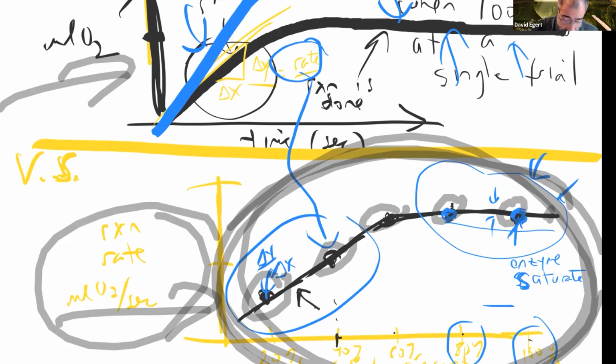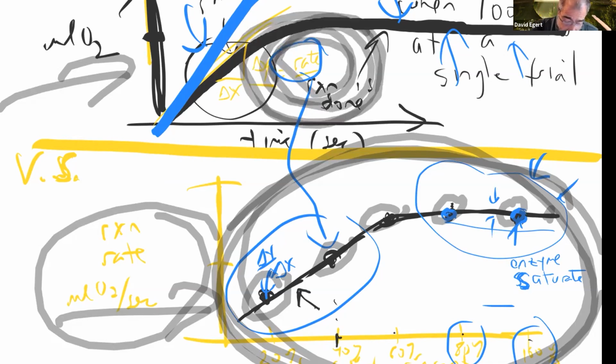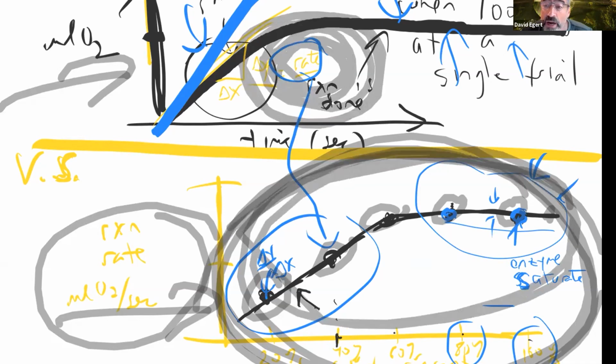How do we actually get the reaction rates that we can then use to check if our hypothesis is supported or not? If you're lost in this, you can reach out and ask me. I'll try my best to clarify it. Or maybe you'll start it, hit a wall, and then send me an email. But make sure that you try it, and if it gets confusing, reach out and get clarification.